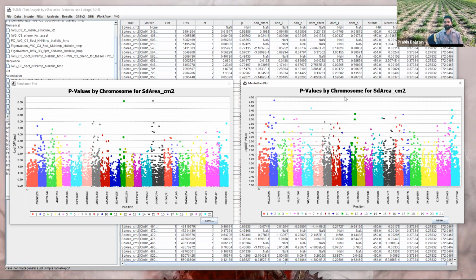false associations, if you use permutation, then the program will suggest a p-value that you can use as a threshold to report anything above it. So we're talking hypothetically here for GLM.